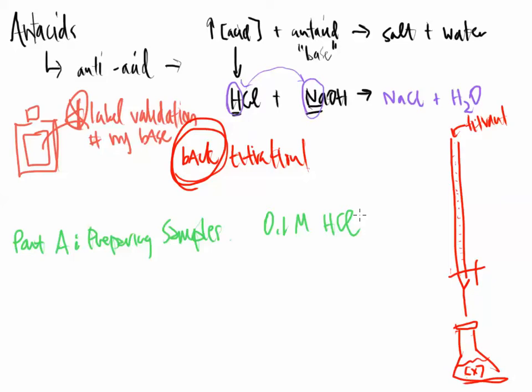And it tells you how much of that to make. It says 400 milliliters is what you need to make. And pour 200 milliliters of DI water into a 600 ml beaker. And then it says in a hood, fill 25 mL graduated cylinder from the storage bottle containing the more concentrated HCl to produce the level needed to produce the 400 mL of a 0.1 molar HCl.